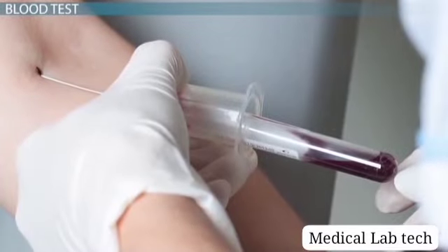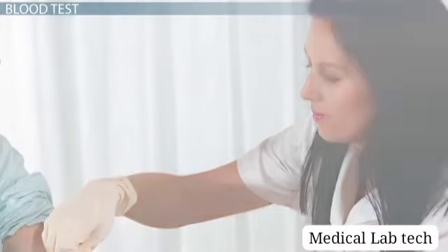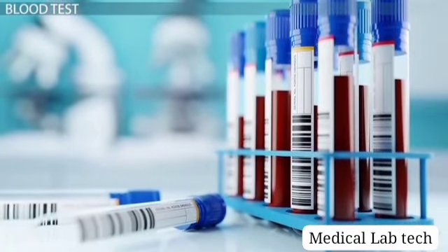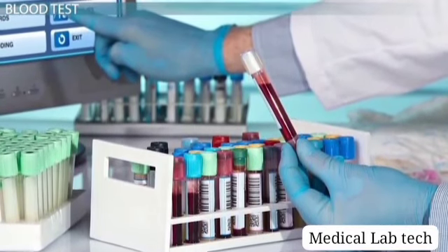A week later, Larry went to the medical laboratory where a nurse drew a sample of his blood. The nurse then told Larry that it would take a couple of days to examine his blood and determine his cholesterol, triglyceride, and electrolyte levels. Sure enough, a couple of days later, Larry's doctor called to let him know that the medical laboratory had sent him Larry's lab results.